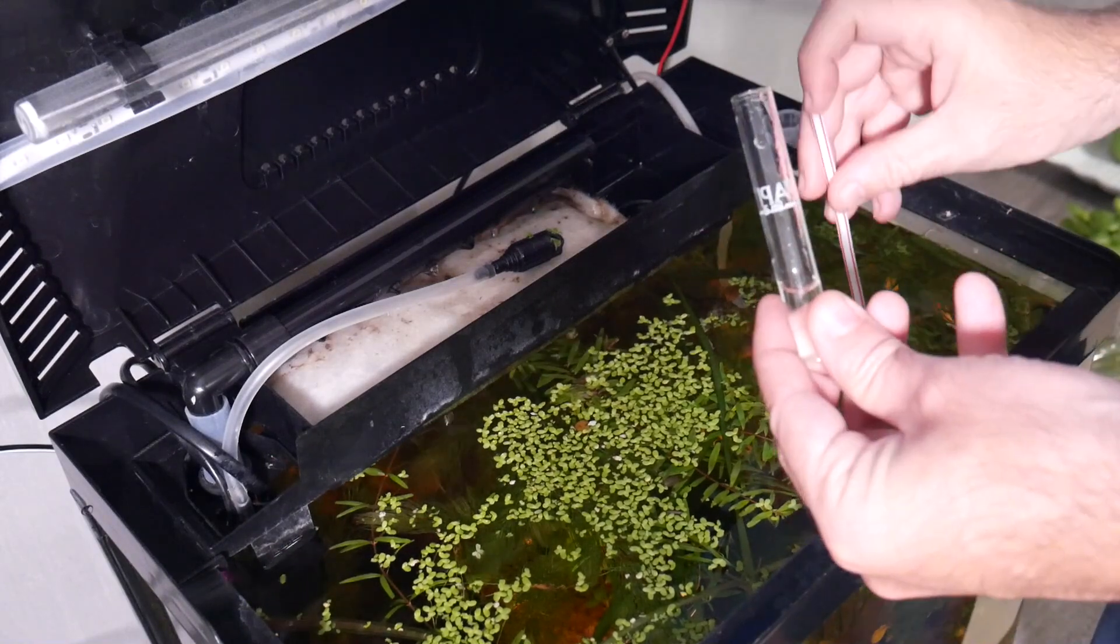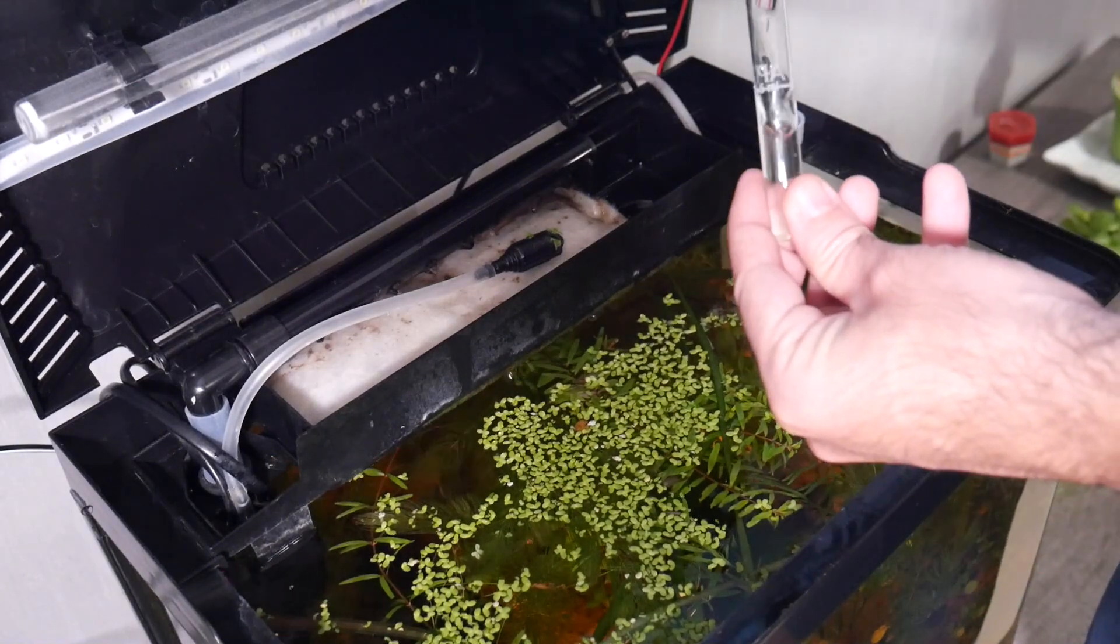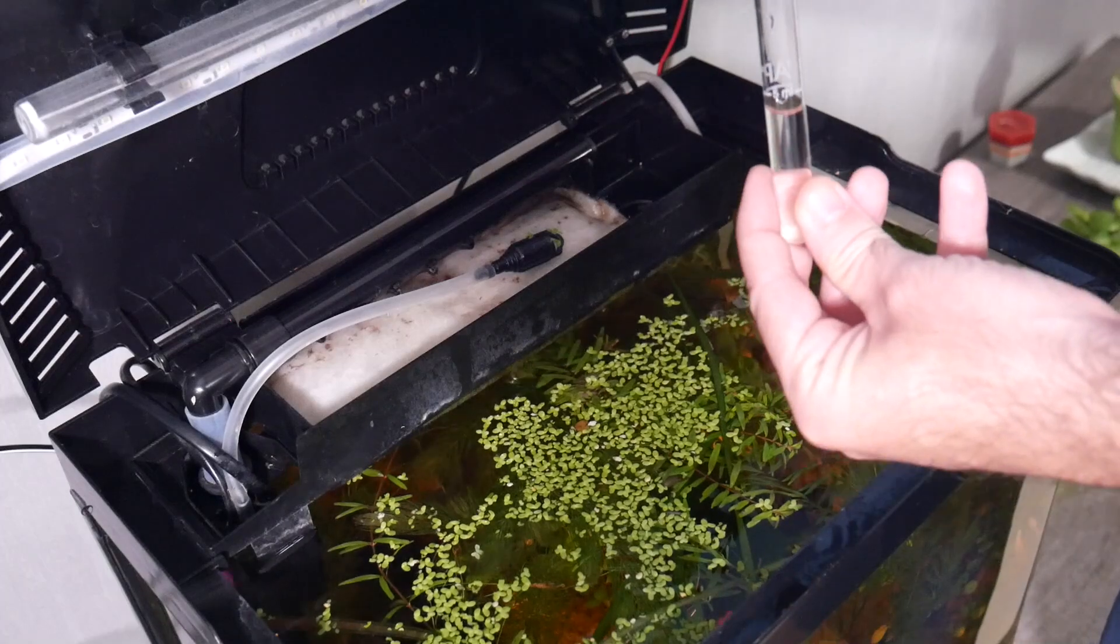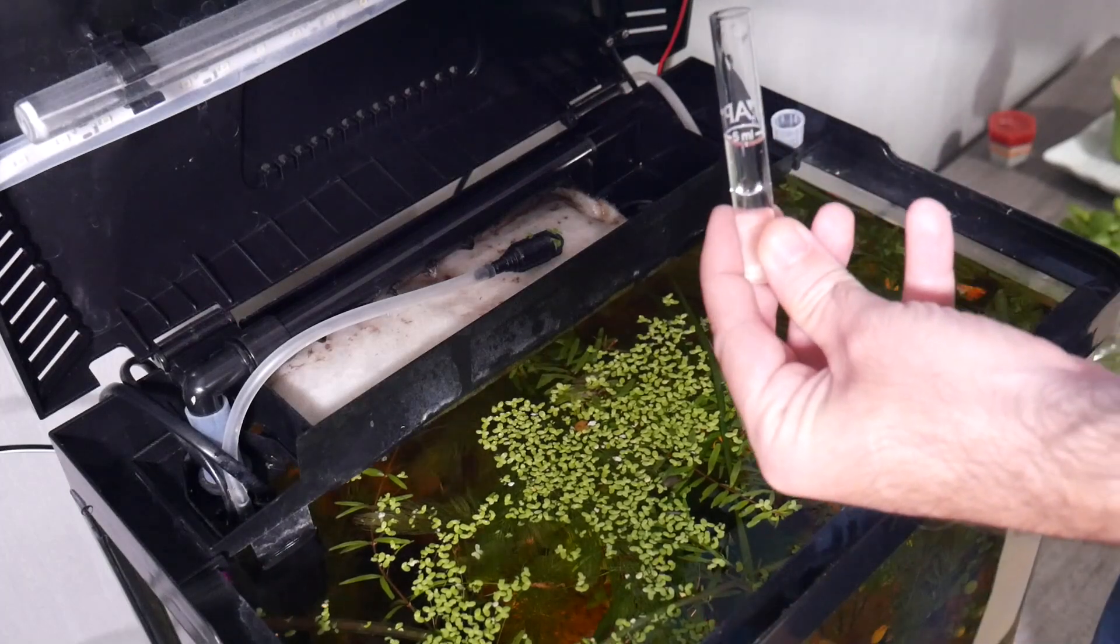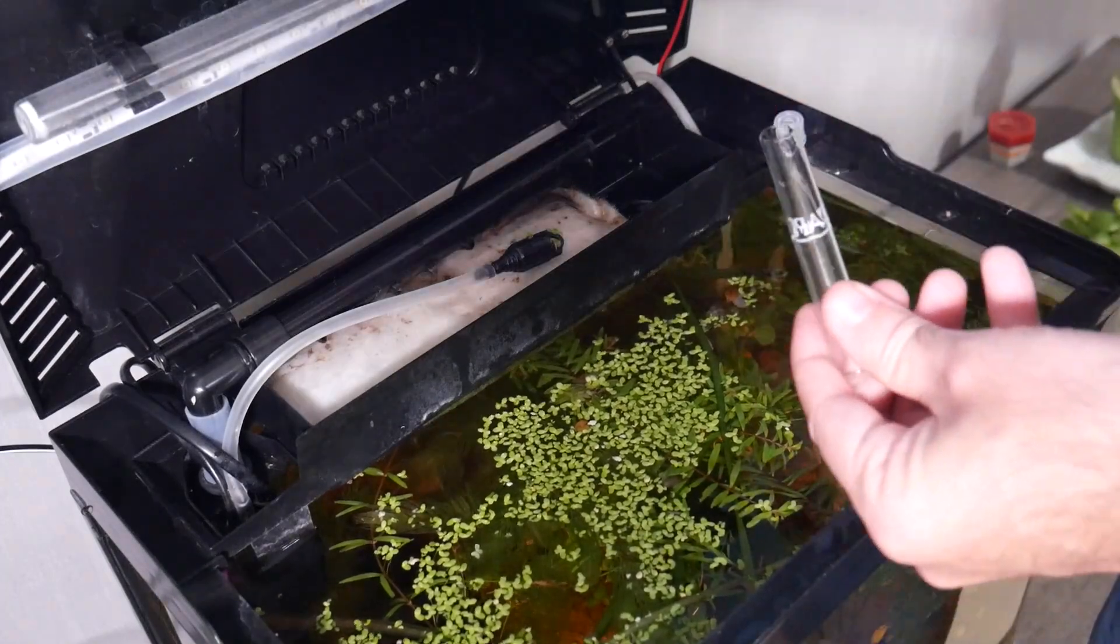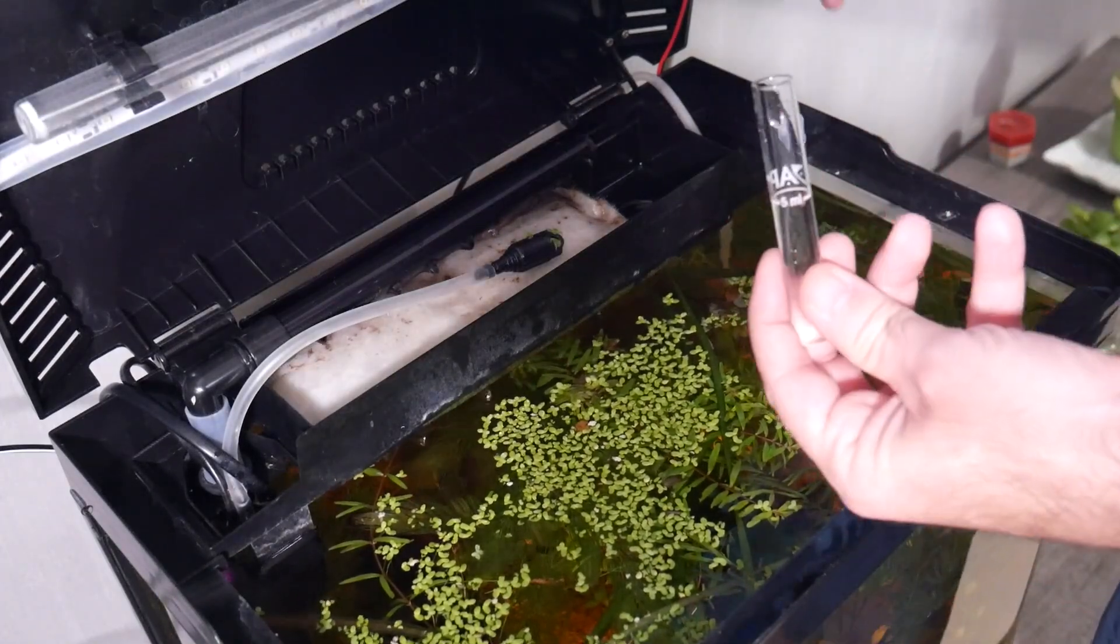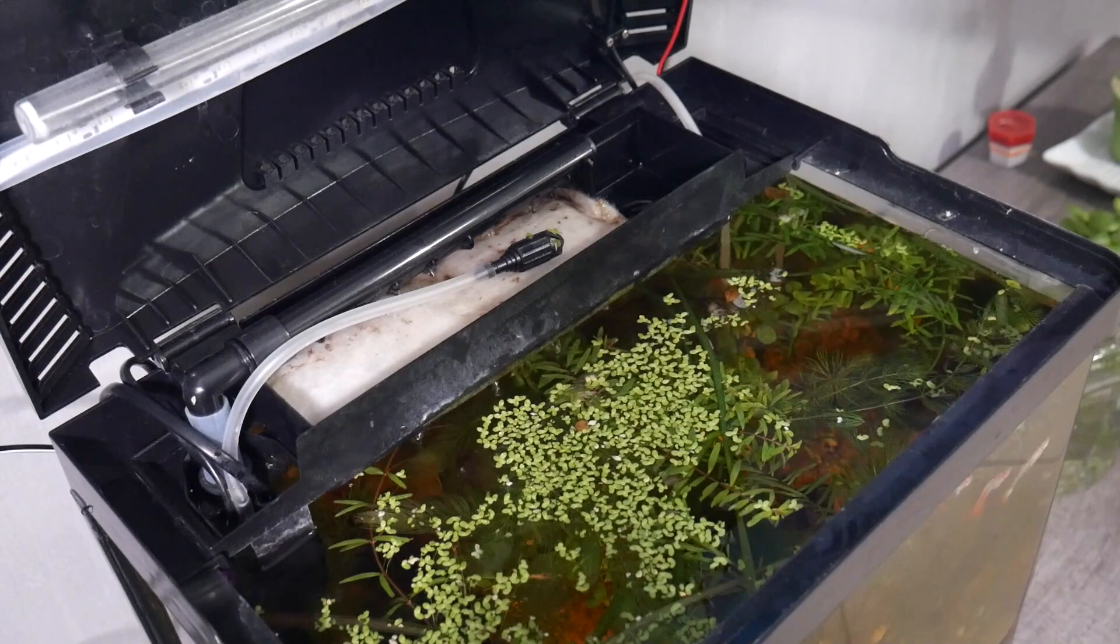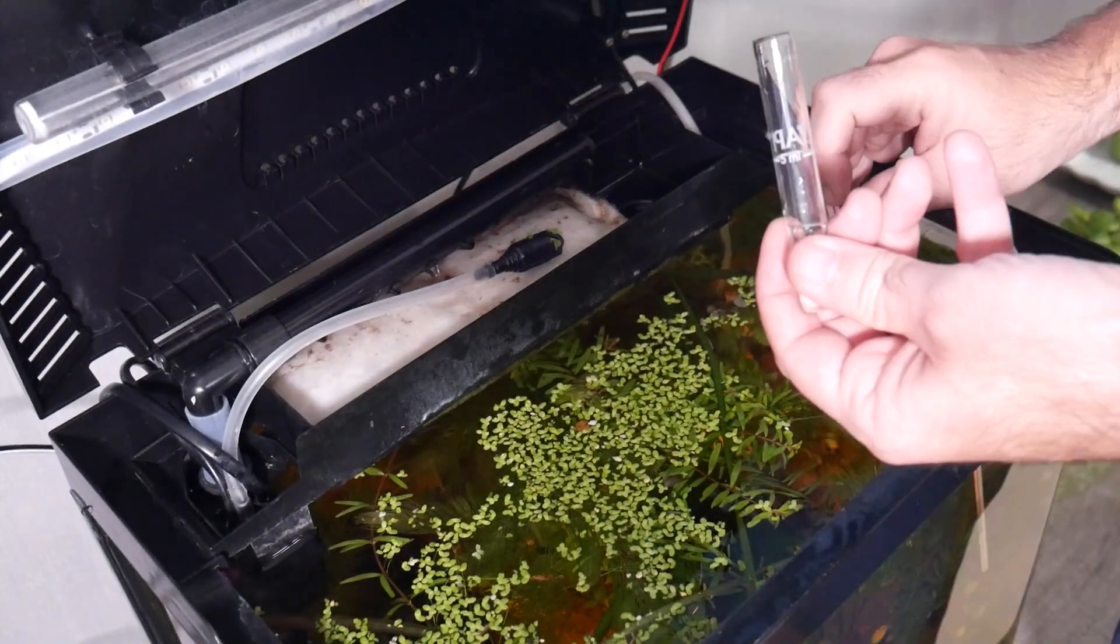We need to fill the four tubes with aquarium water. To do that I am using a straw, this is a more precise method instead of dipping the tube in the aquarium. If you have a syringe, you can use it also. After we fill all the tubes, we can continue with the test.